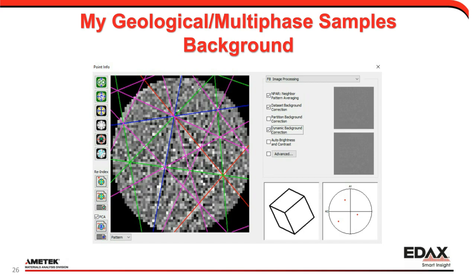The other way I can do this is I could start to partition it. And if I did the partition-based way, instead of using a dataset background, I could use the partition-based one. Because of this partition-based method, I can say, okay, just take this EDS data, break it up into just heavy iron stuff, the higher diffractor. I can start rebuilding it by phases and say, okay, this phase, this chemistry, use this, and I can start breaking it down into different basic phases, different partitions with different backgrounds.